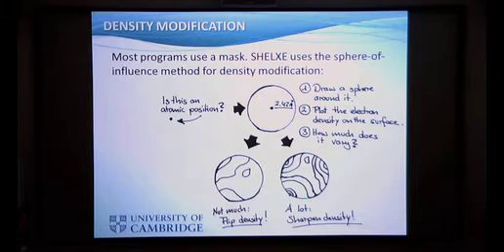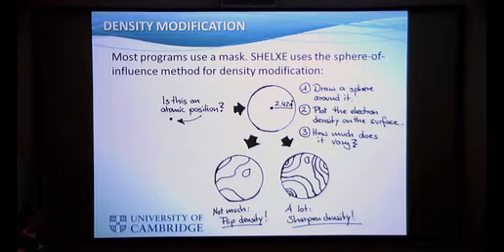If it varies a lot, like here, we sharpen the density, making peaks higher and gaps lower. Because you can clearly see, if you see a distribution like this, you possibly expect 3 other atoms on the surface of the sphere. And this initial position is very likely to be an actual atomic position of protein.